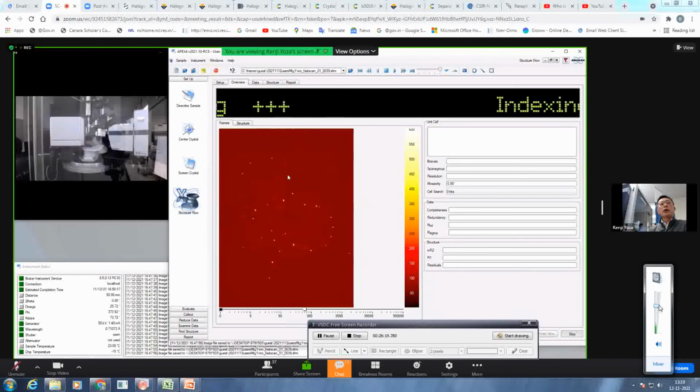So I expect 1 minute later, it will provide the initial structure. Please wait a minute.